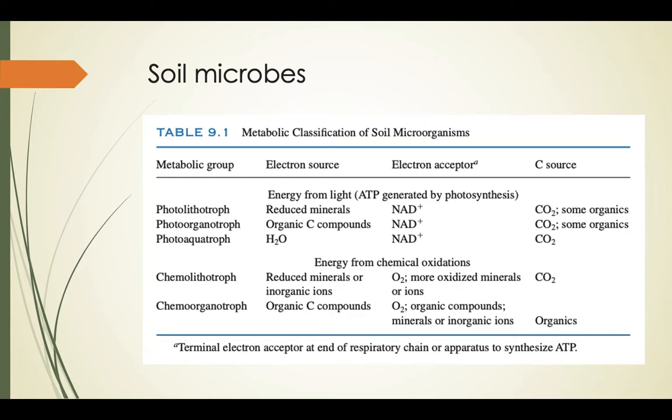Now, a second important component of the virtual laboratory session is the isolation and quantification of soil microbes, particularly bacterial groups and fungi. Before we discuss the expected results, let's walk through some key concepts. We can classify soil microbes metabolically into phototrophs and chemotrophs.